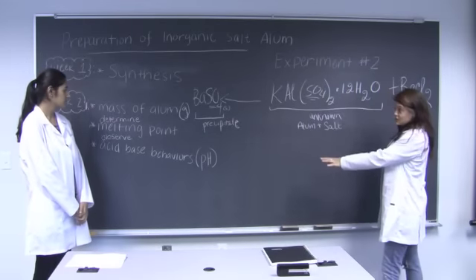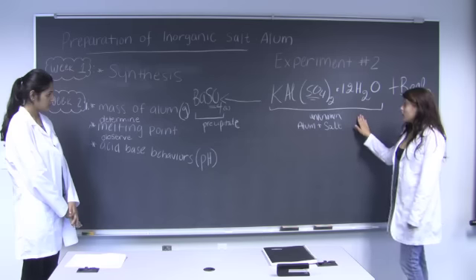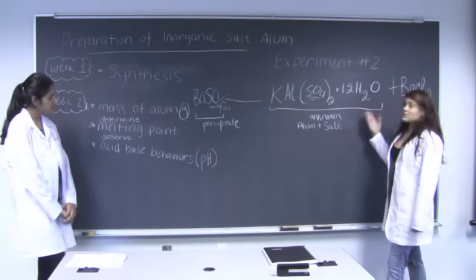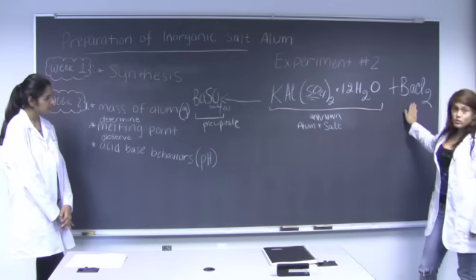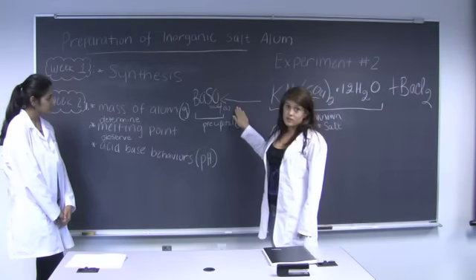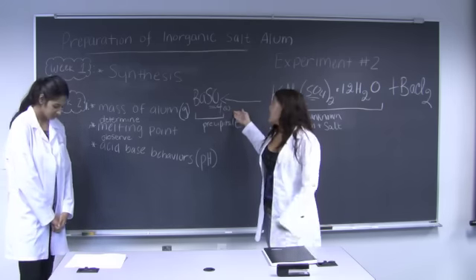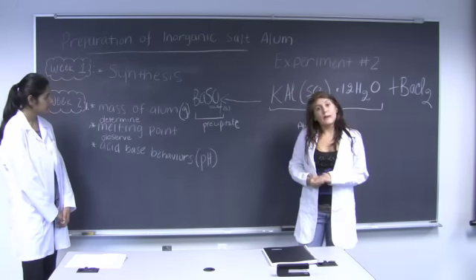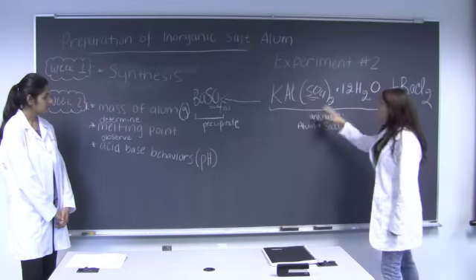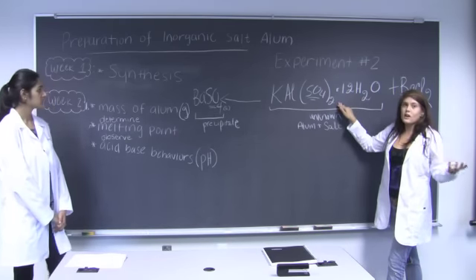Along with those procedures in week 2, we're going to be conducting another experiment in which we're given an unknown. The unknown contains alum and another salt. We're going to react this unknown with barium chloride, and they're going to produce the precipitate barium sulfate. Because barium sulfate is extremely insoluble in water, we're able to collect it and measure its mass. By taking the mass of the barium sulfate, we can therefore determine the mass of the alum in the unknown, which will help us determine the chemical composition.